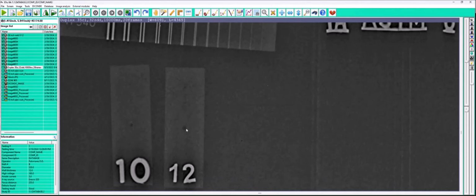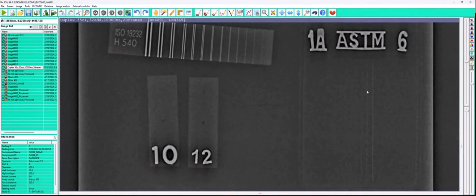And really what they're looking for is the 2T or however many wires is required for this thickness. So we're seeing 1, 2, 3, 4 wires, roughly 3 wires maybe on your computers, which qualifies this thickness, this technique for whatever this application is.